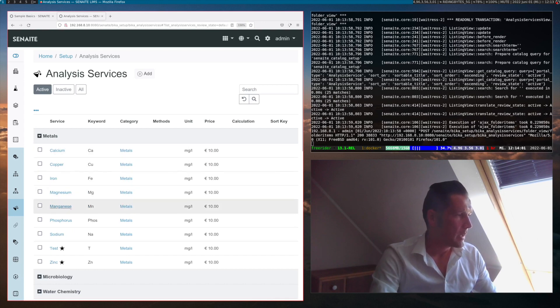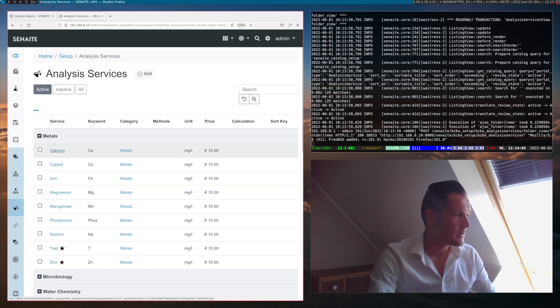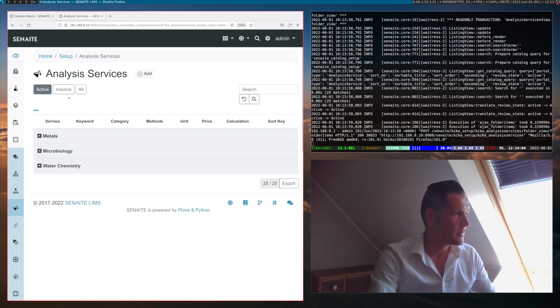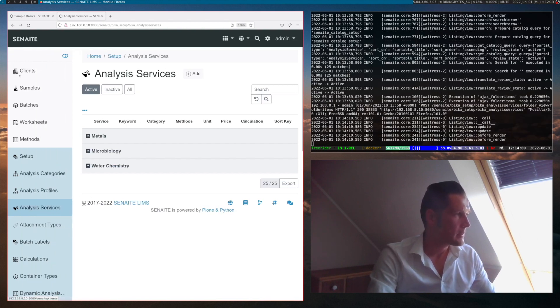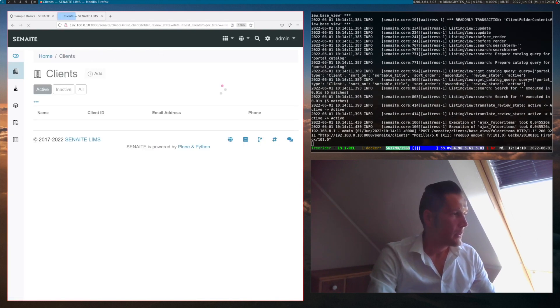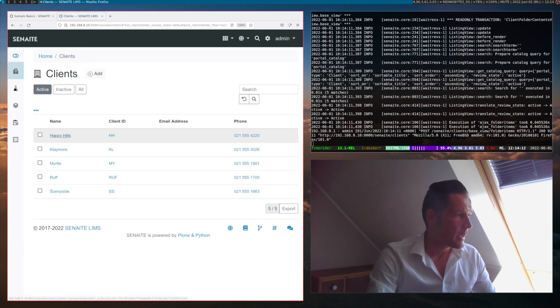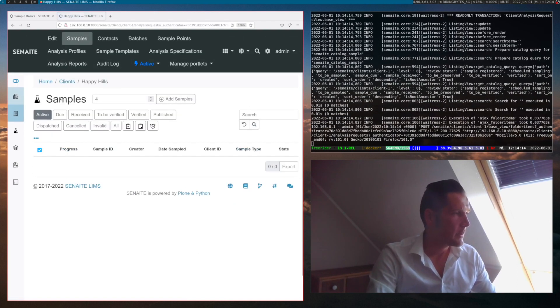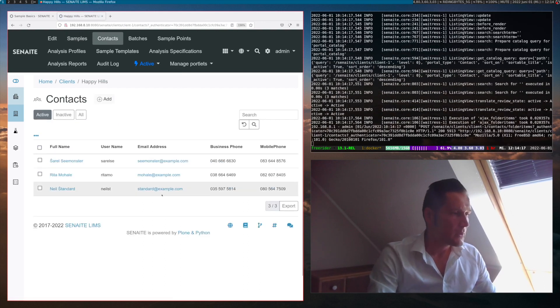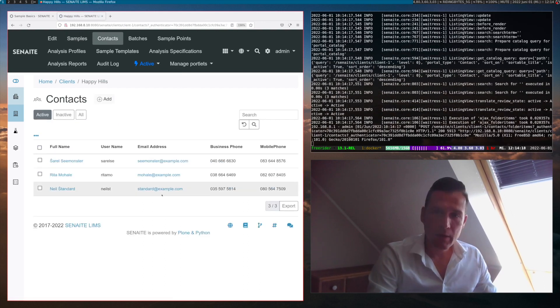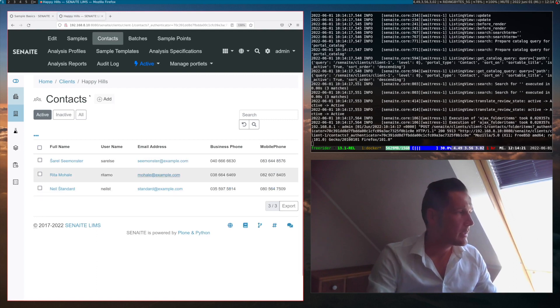We see some metals listed — these are the categories that analysis services have been created for us. And in the clients tab, we can see that some clients have also been created. For instance, the Happy Hills client, where contacts have also been created. So everything is ready to start immediately with creating a sample.